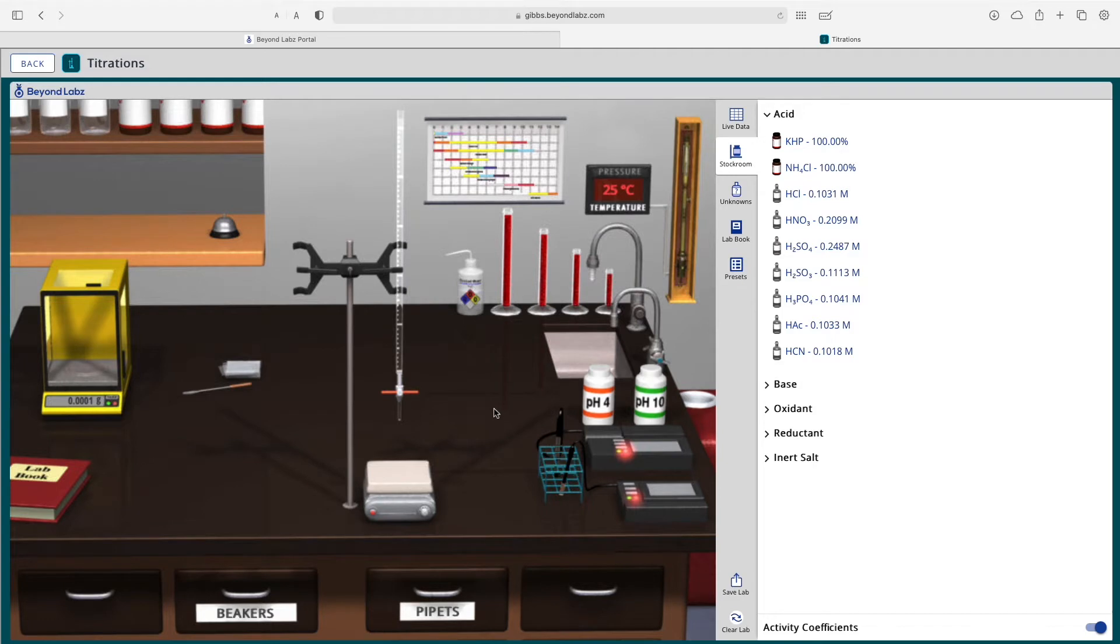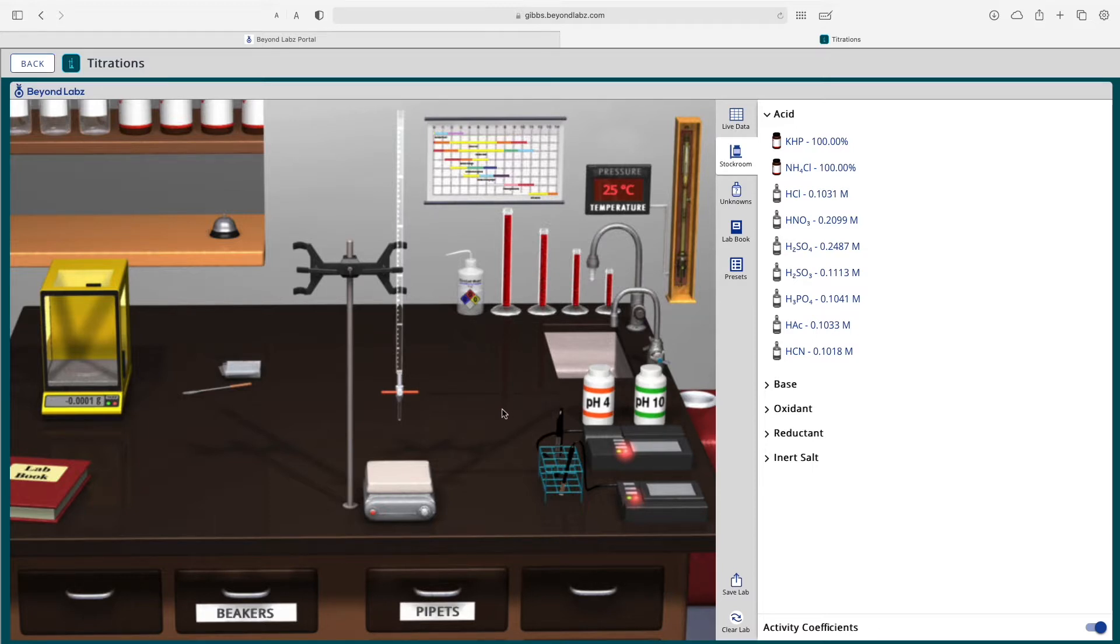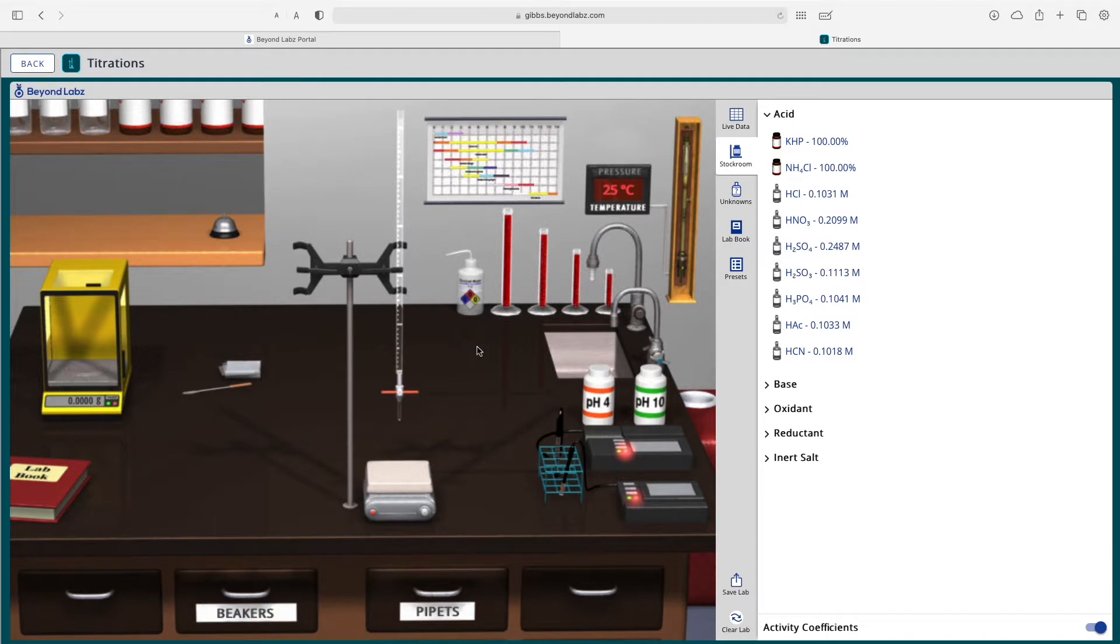Welcome to the overview of the titrations laboratory. This video is designed to give you a quick overview of what's available in this laboratory. If you would like specifics on any of the things that are covered here, please watch our other videos on our Vimeo playlist that cover all of these things in detail.